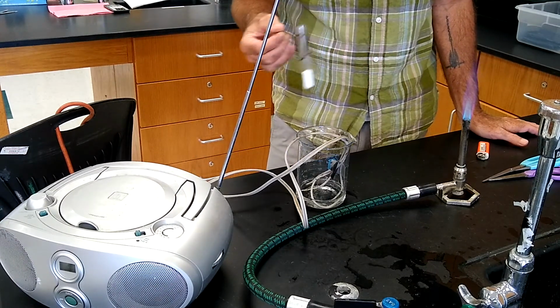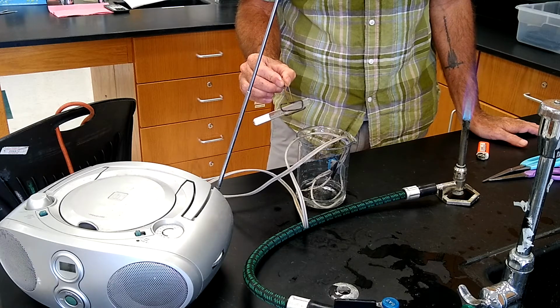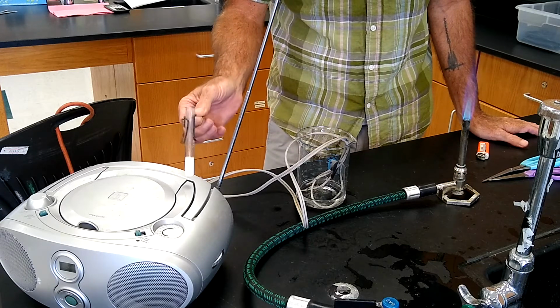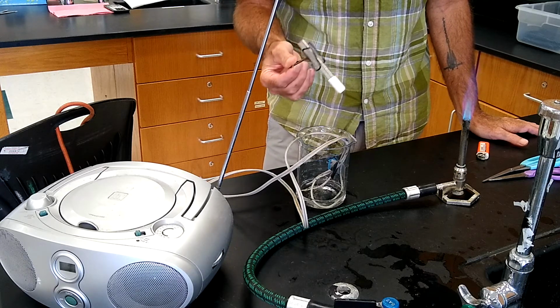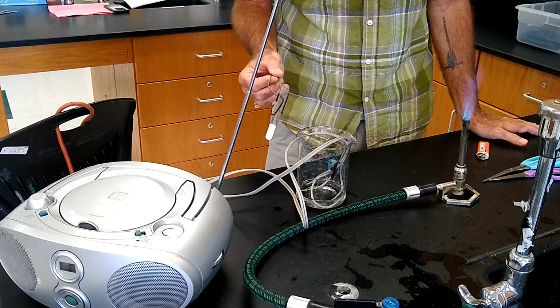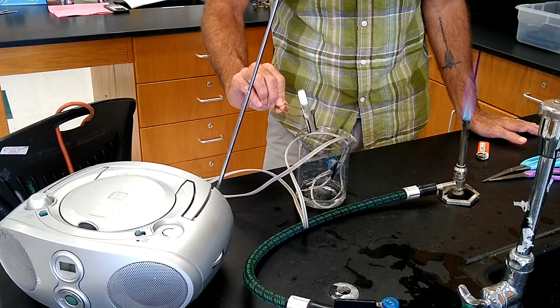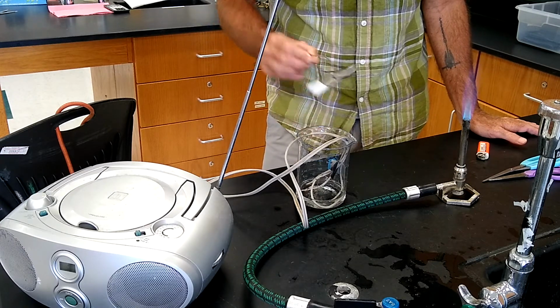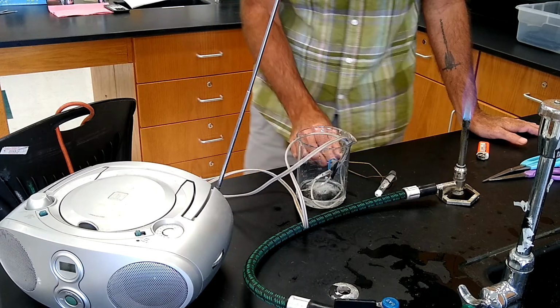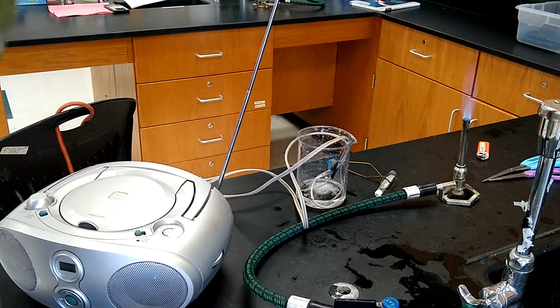Question number two, if I pour it into this water, will it dissolve and conduct electricity? The way we will know that is it will turn on the radio. So will this powder that did not melt, will it turn on the radio? Here we go. Oops. Guess you have your answer.